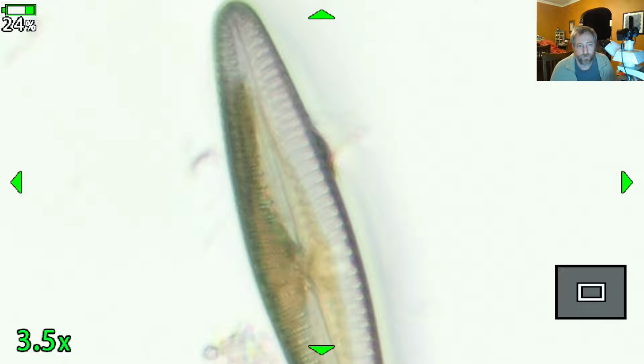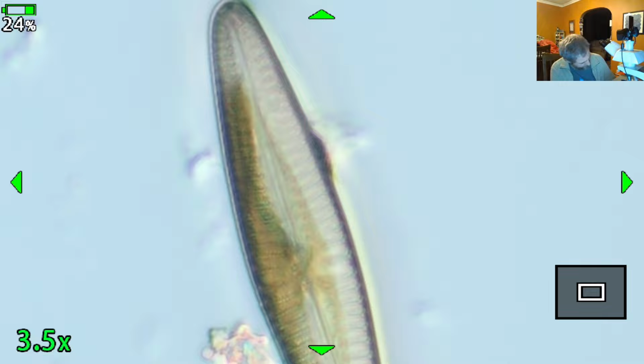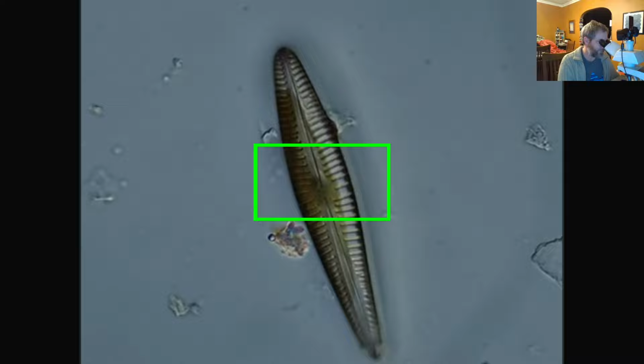I said they look a little bit like a submarine, as an example of one of them. Oh, that's not a good image because I need to switch this. Actually, it would probably be better if I just switched everything over to the oil objective. Sorry, minor adjustments required. There we go. Now you can see it nice and clearly, except I'm super zoomed in. So yeah, they look a little bit like a submarine.